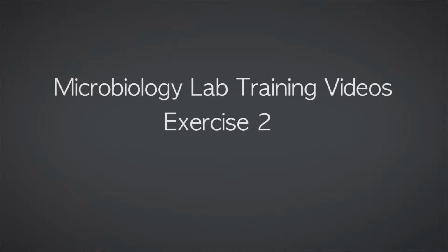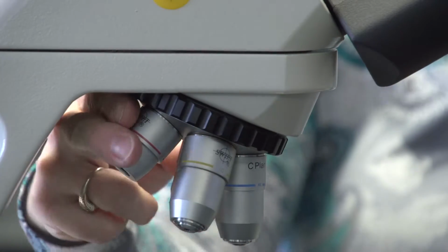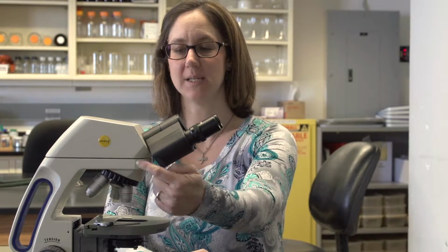Hi, this is exercise 2 in our lab manual, and we talk about microscopy in that exercise. So when we take a look at the microscope, we'll first talk about the ocular lenses. The ocular lenses have a 10x magnification power. The objective lenses in the microscope, there's a 4x, a 10x, a 40x, and a 100x objective that can all rotate into place. Which means if you have the 4x objective lens in place and you have 10x lens in the oculars, you'd have 40 times magnification going through the scope.